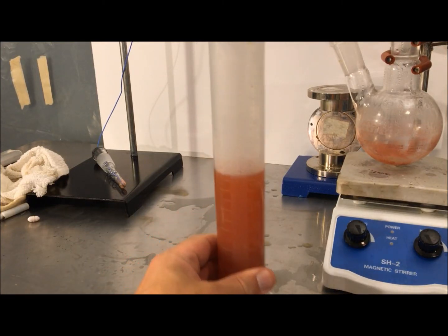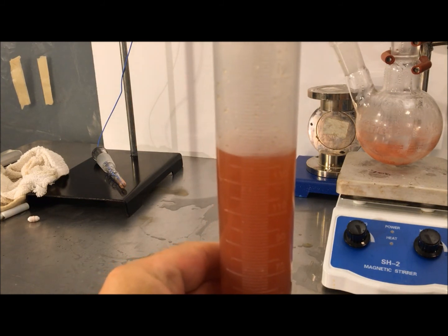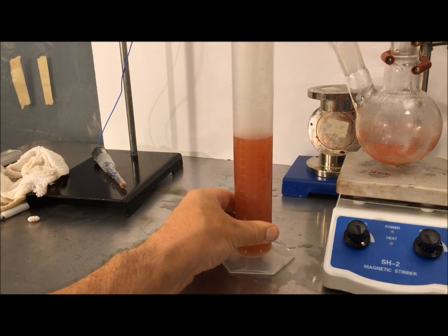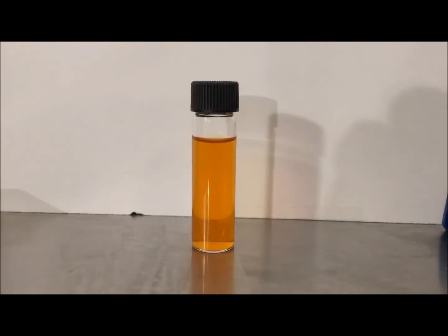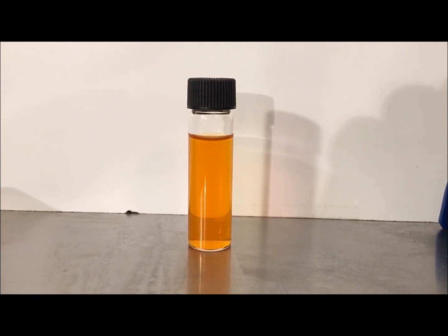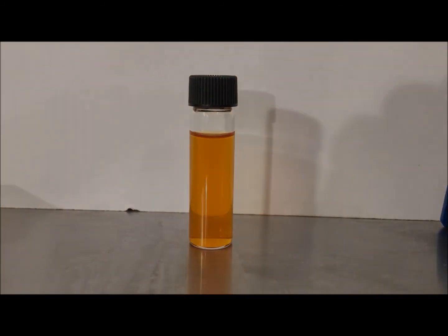Alright, let's see what we got here. About 147. Here's what the product should look like. It should be clear, not cloudy, and there should be no precipitate at the bottom, and it should stay this way indefinitely.